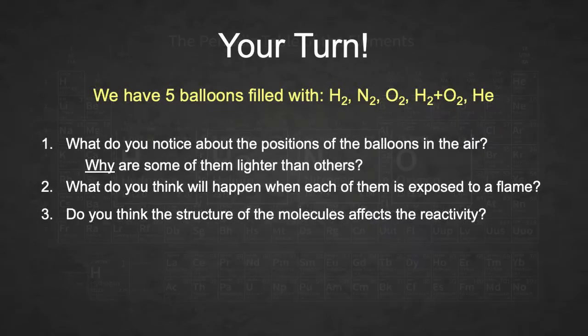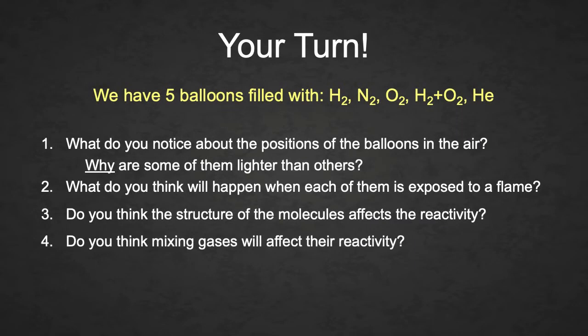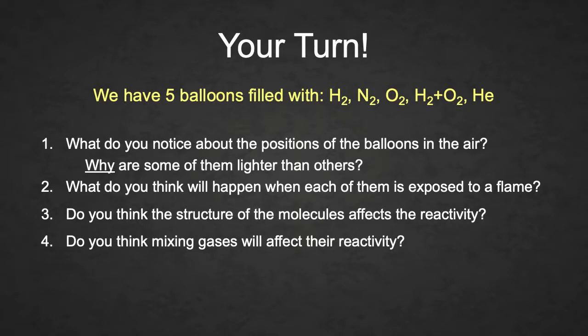And the last question I'd like you to consider is, do you think that mixing the gases has any effect on their reactivity? Like, does the environment matter? Should we be thinking about what chemicals are around the chemicals that we're working with? Does it matter? I bet it does. All right, I want you to ponder those questions and then we'll go ahead and do the demo.